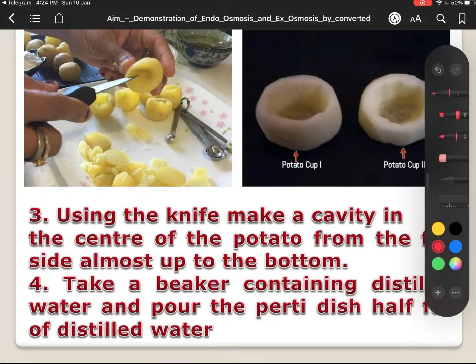Now, using the knife, we have to make a cavity. You can see here — this is the cavity — this type of cavity we have to make inside the cut potato.